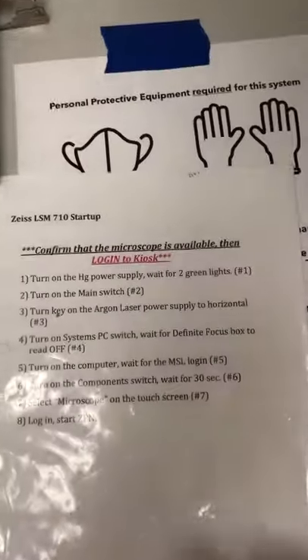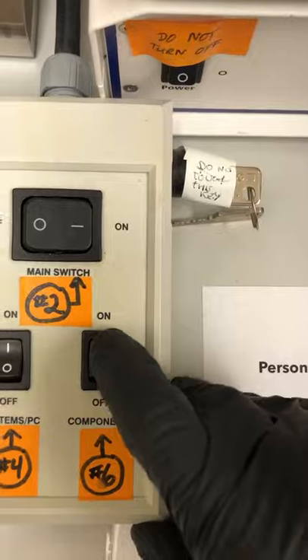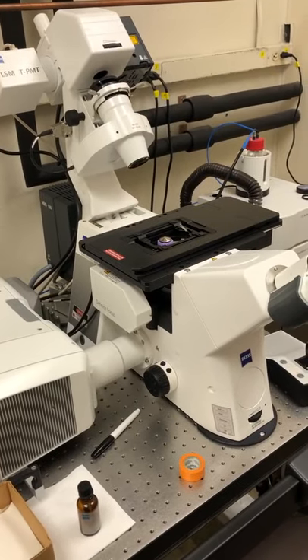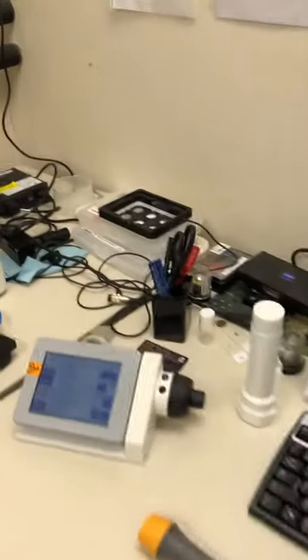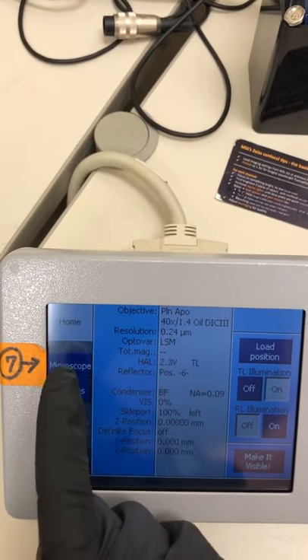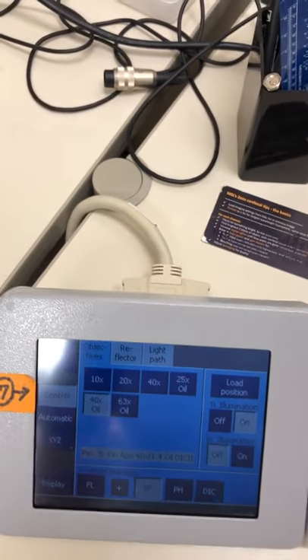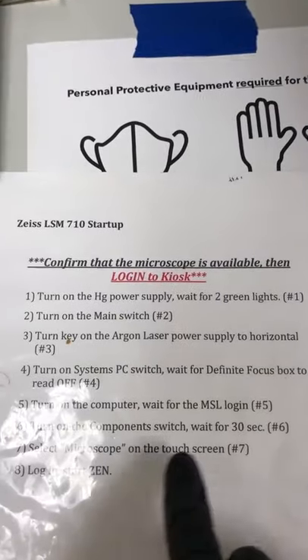The next step is to turn on the component switch and wait for 30 seconds. I'm going to switch it on and then wait — the microscope is going to make a bunch of noise. Once that's done, you continue. I waited for the 30 seconds. The next step is to press the microscope button on the touch screen. This gives us access to a dialog box which allows us to change objectives easily. So we've done that — select microscope on the touch screen.